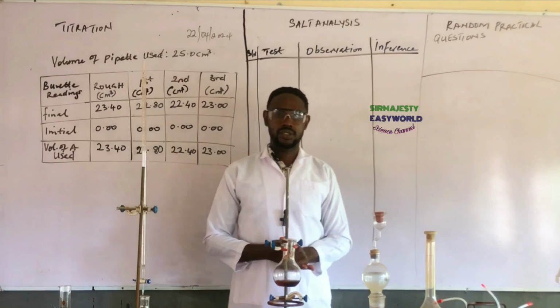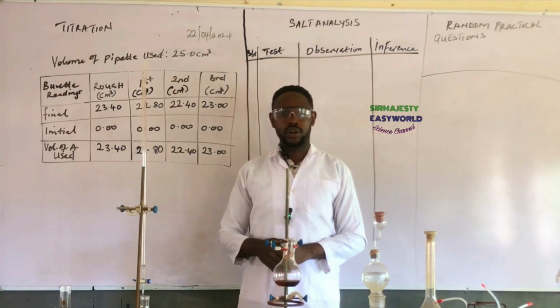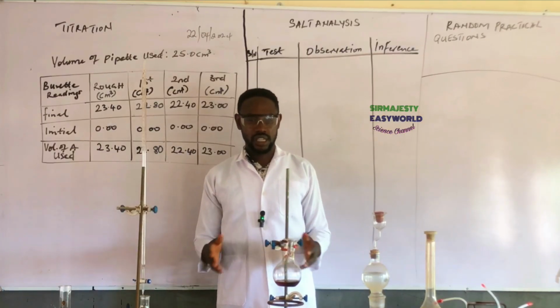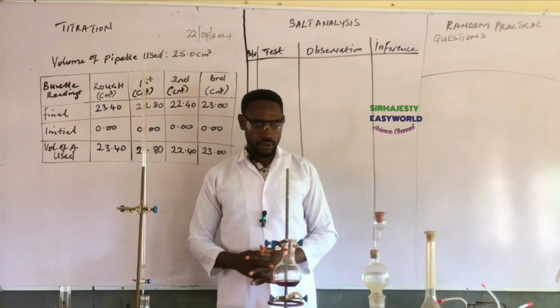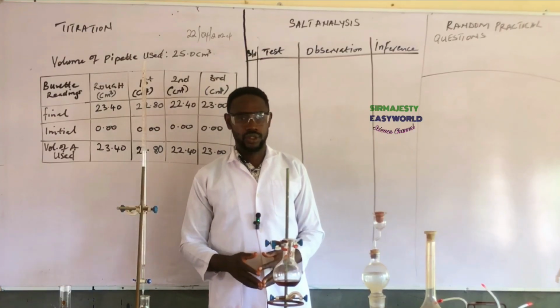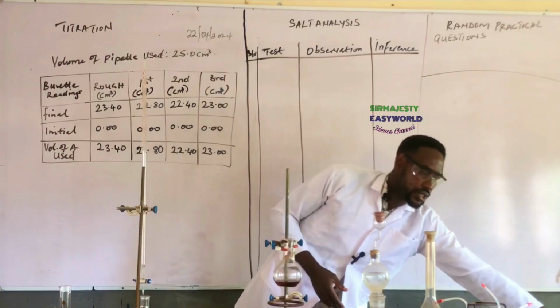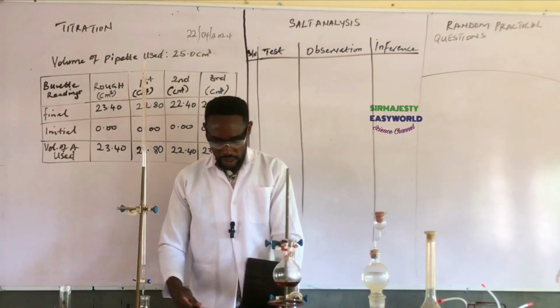But when you don't listen to your chemistry teacher well, you will not get this titration, because the marking scheme standard is that there is a range you will not exceed, so that you get the maximum score. First of all, in titration, we will face with a question similar to what you see there on the screen. Let me read it from here.